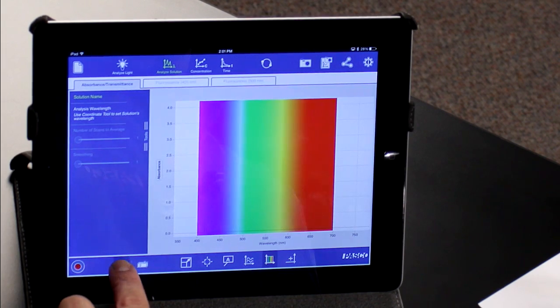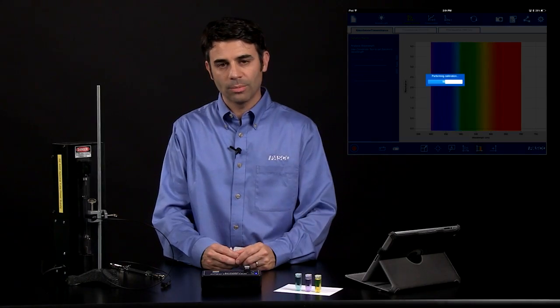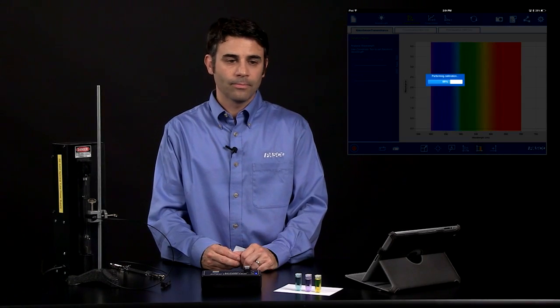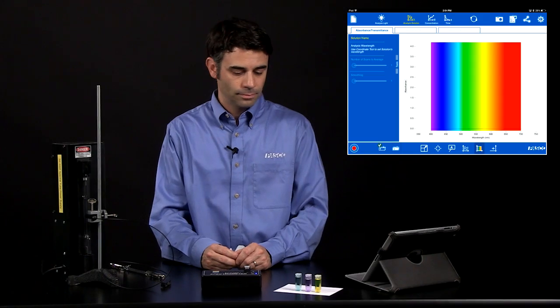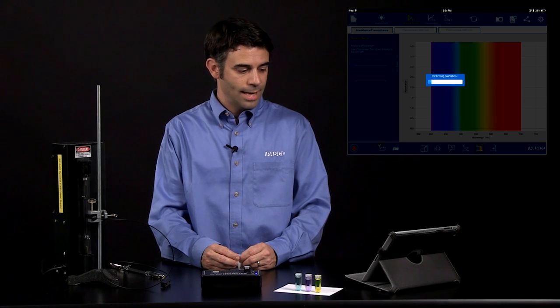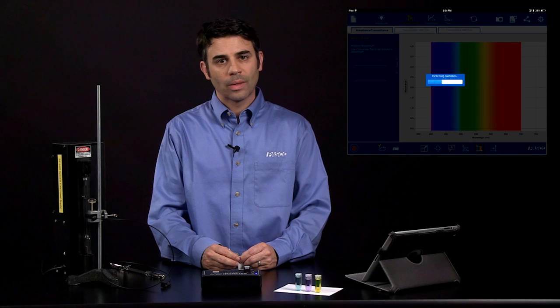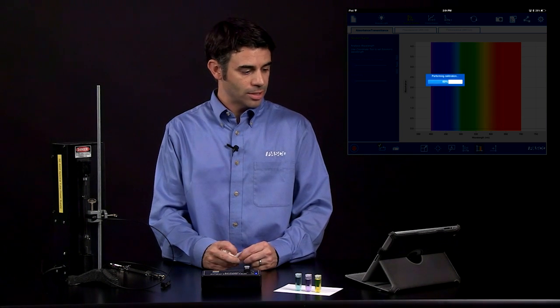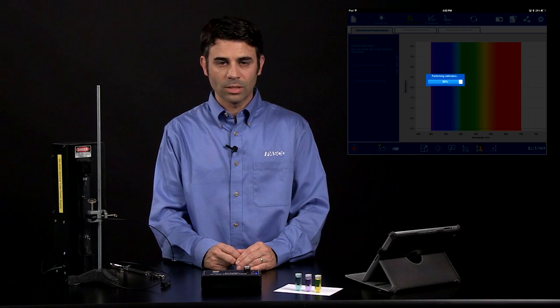I'm going to calibrate dark, meaning that the light in the spectrometer will be turned off. And I'm going to calibrate light, meaning that the light in the spectrometer is now turned on. I'll go through a calibration procedure, determining an integration time and setting the best calibration for you based on the solvent that you have.